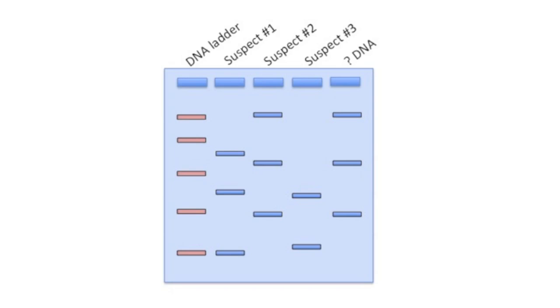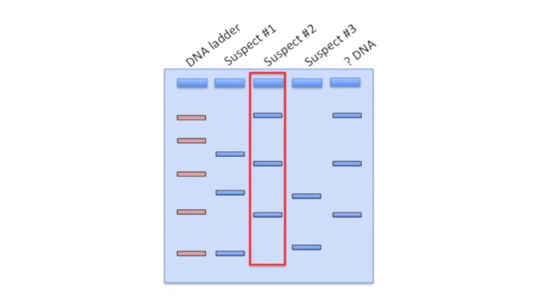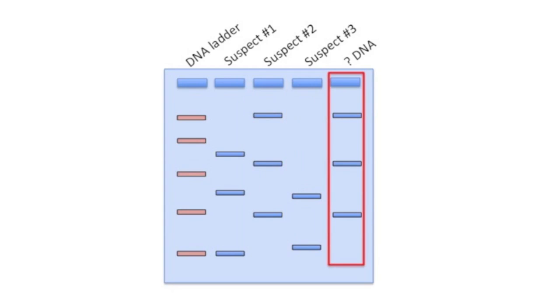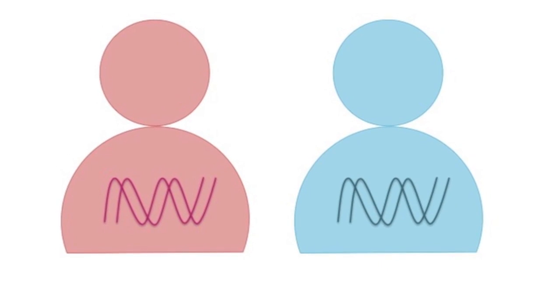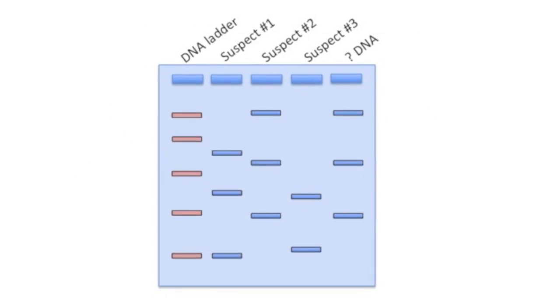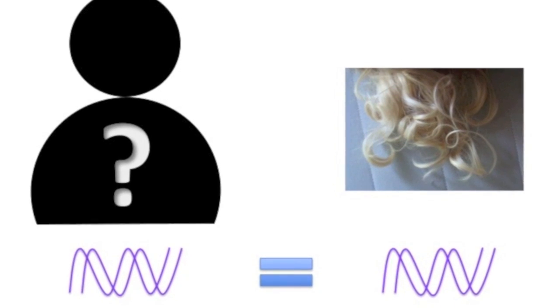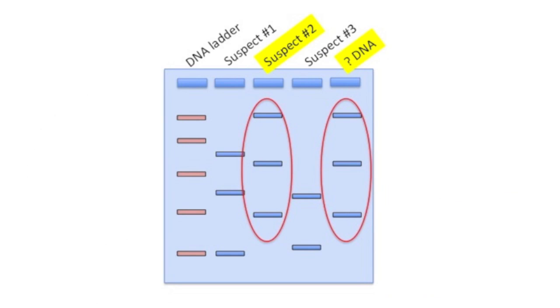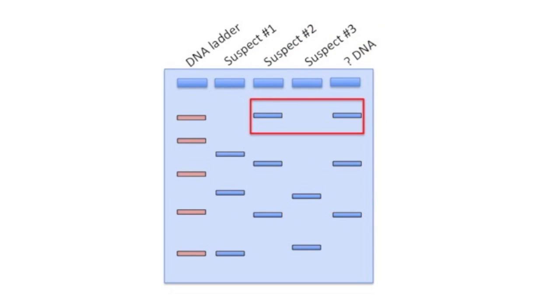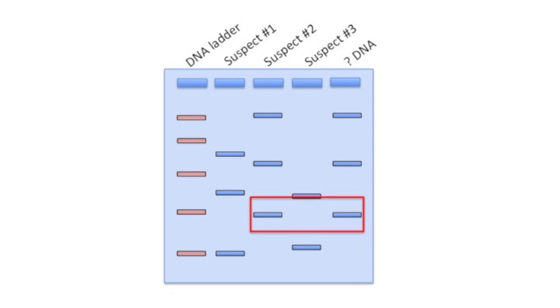Here's our finished gel picture. As you can see, in column 1, we have the ladder. Column 2 has suspect 1's DNA, column 3 has suspect 2's, and column 4 has suspect 3's. The last column has the mystery DNA from the hair strand found at the crime scene. As we mentioned earlier, each person has a unique set of DNA, so the DNA location on the gel, or in other words, the DNA sizes, should match between the suspect who actually committed the crime and the hair's DNA. In our case, that's suspect 2. Each DNA band in the mystery DNA column appears in the same location in suspect 2's column, indicating that the two DNA samples come from the same person.